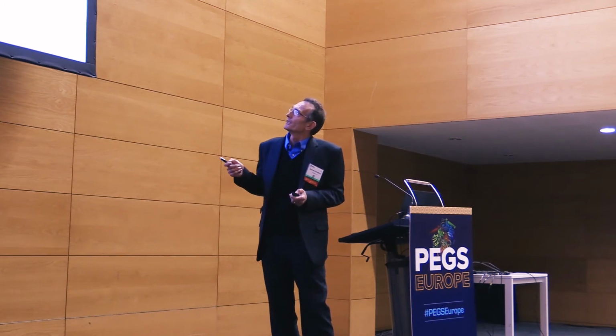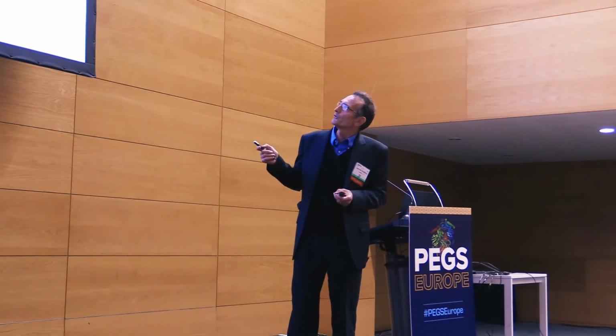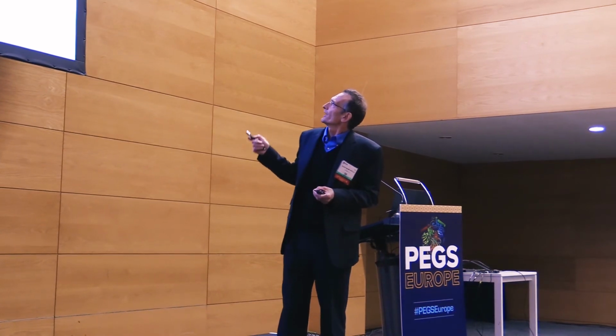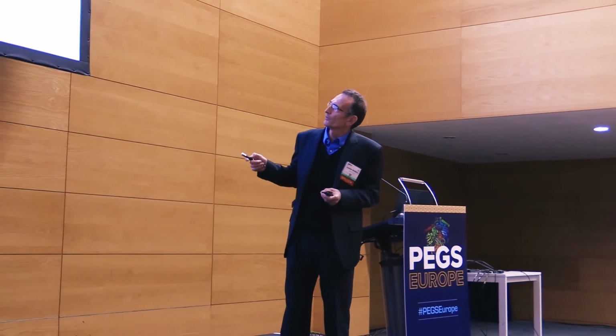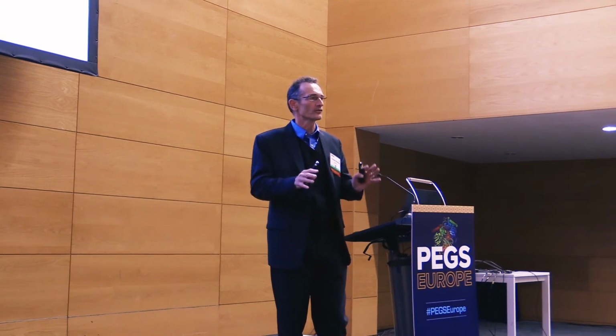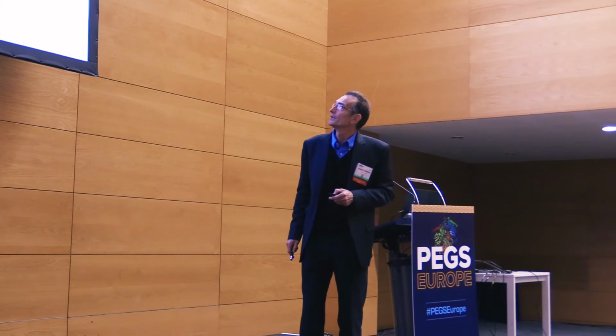So this shows the yeast display. What you have in blue is the therapeutic starting scaffold, and you'll see that the library, which is in pink, essentially overlaps in all cases with the therapeutic scaffold. So what we have is a library of antibody fragments displayed on yeast that performs essentially identically to the therapeutic scaffold from which it was derived.